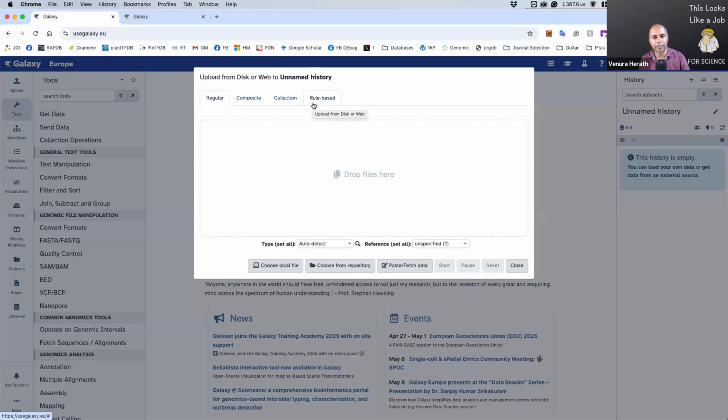I will show you how to make a collection. You go to the collection, and it should show you the two files you already uploaded. Go ahead and check your Galaxy environment and see whether you can see both files. If you can see both files, please say yes. If you're facing any issues, you can either use the chat box or unmute yourself and let me know.